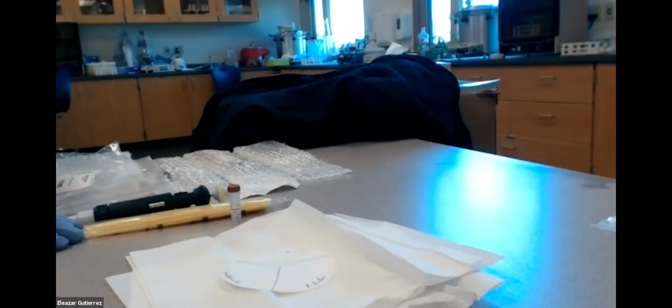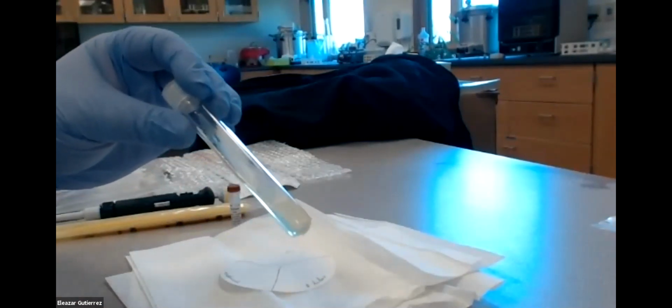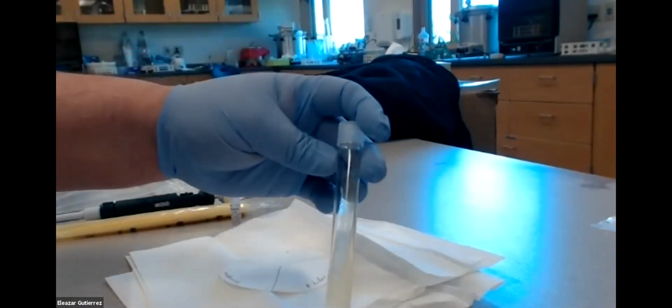There's a lot of strange things in these lab protocols that I don't understand why they do. The one thing that we do need to be aware of is that they are relatively fresh cultures of microorganisms. I think that the author tells you about 2 weeks. If you're concerned that yours is too old, then just do a new slant or do a new broth. Once done, put it somewhere nice and warm.